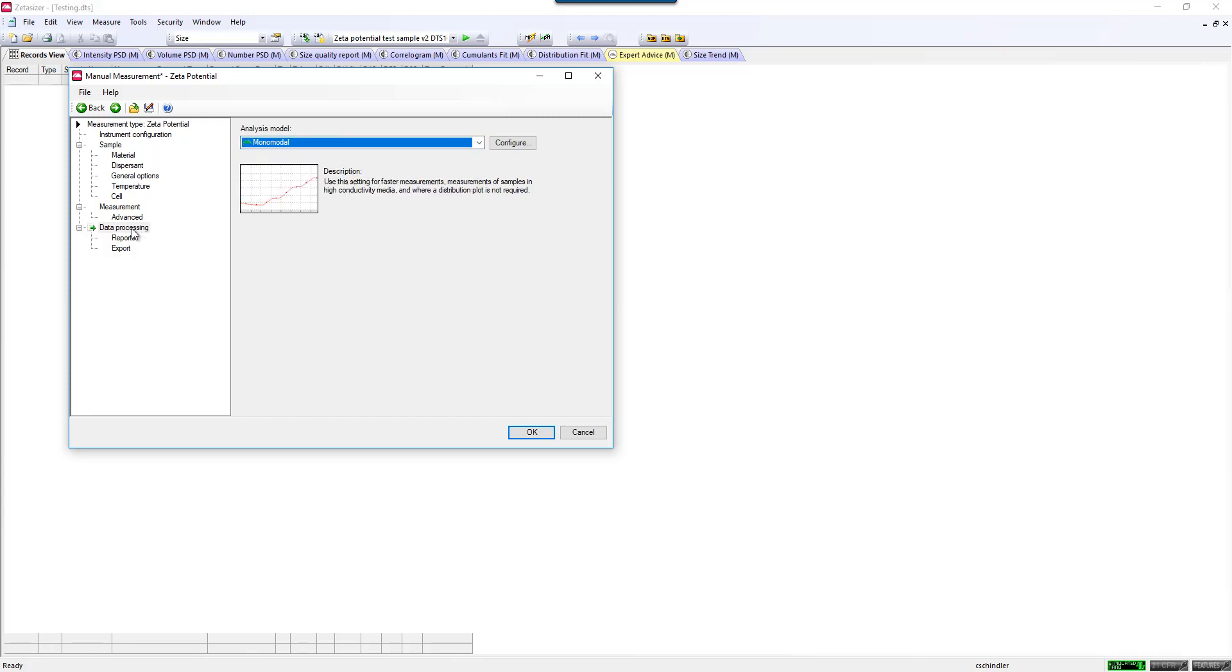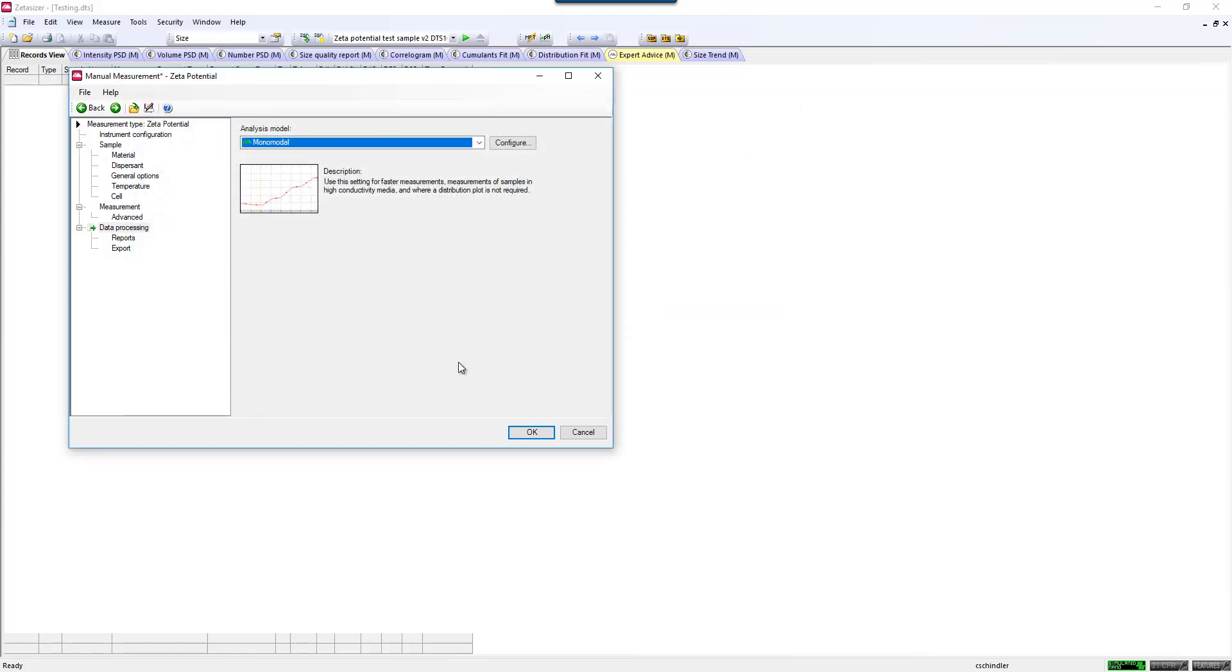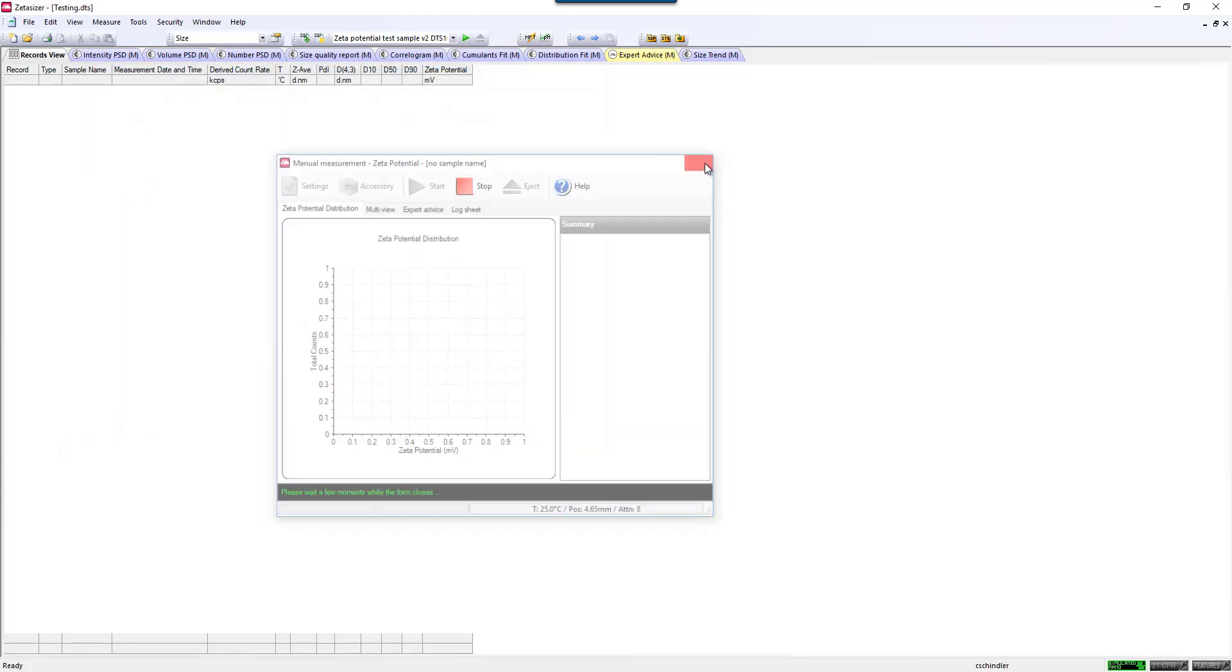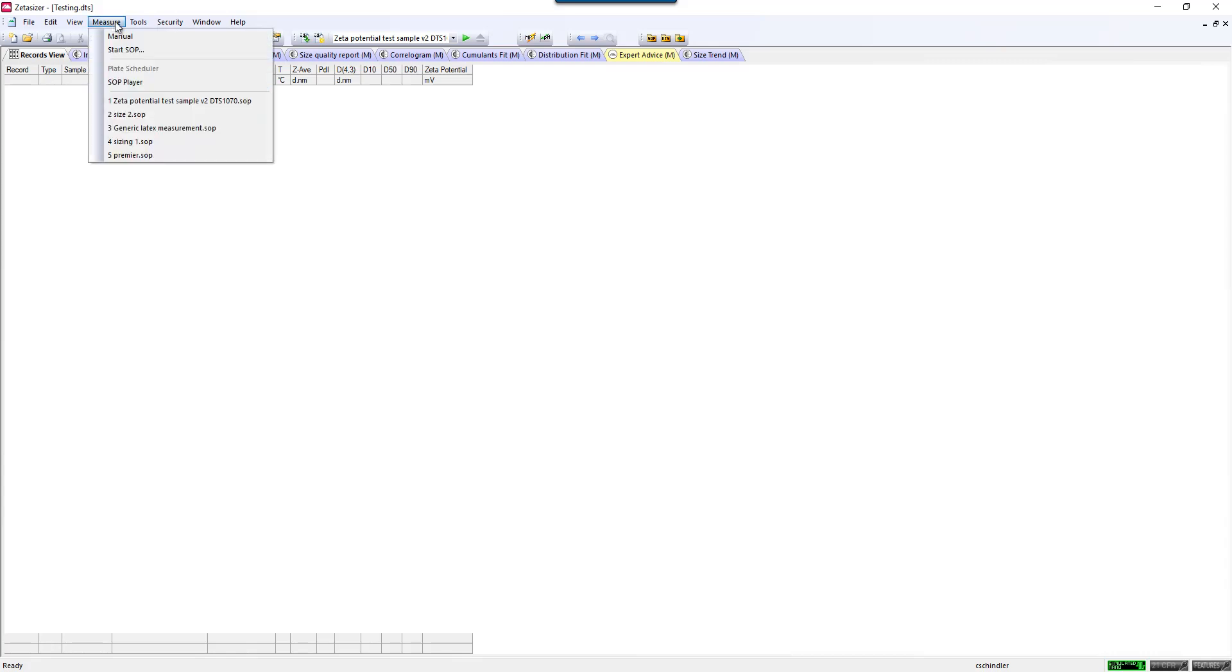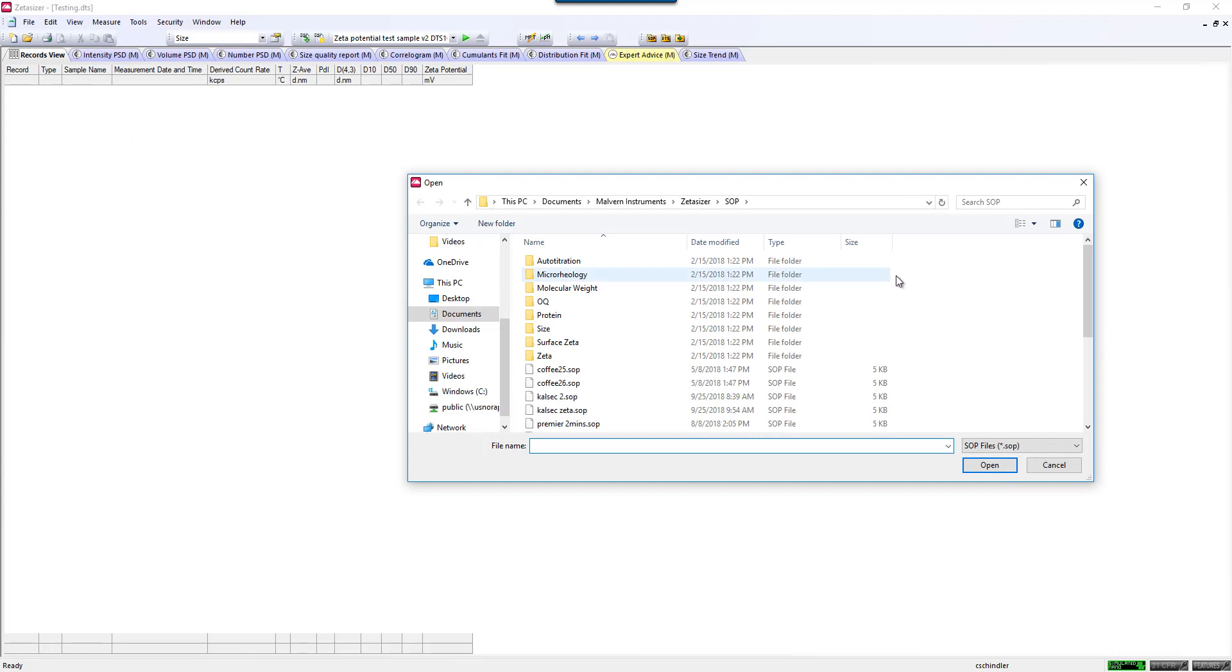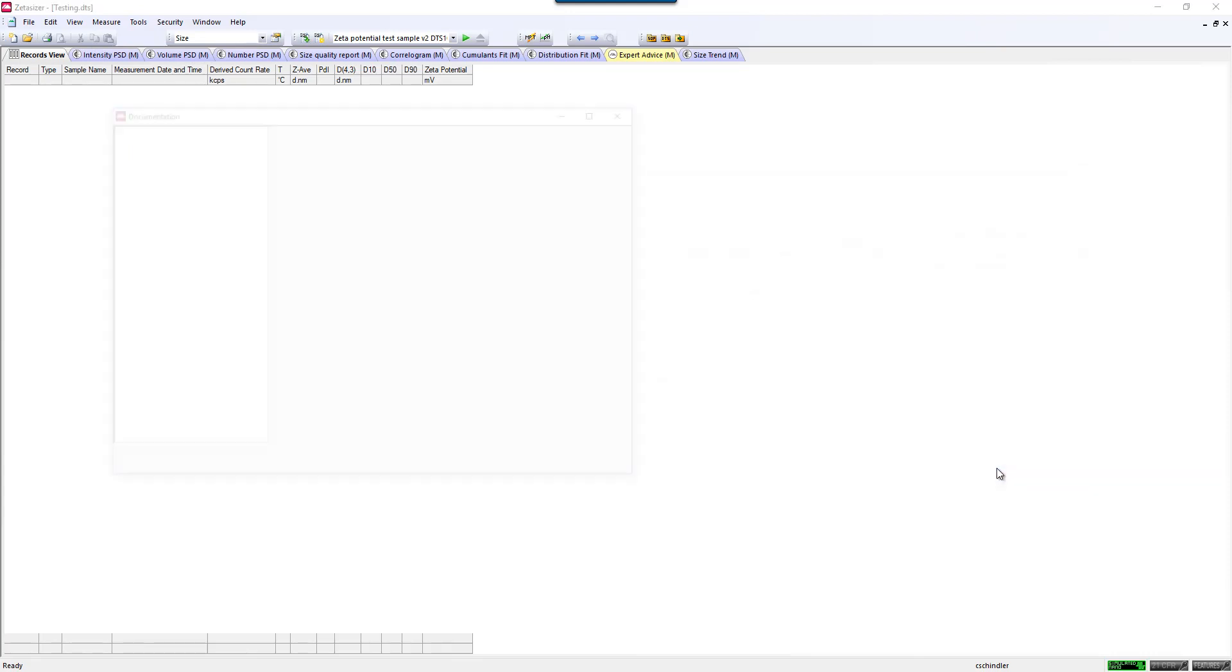If you are happy with your SOP, you can save it with a unique name. And you could immediately run that sample, or if you would like to create more SOPs, you can do that. Once you're ready to make a measurement, go to Measure, Start SOP, and select your unique name that you've saved your SOP as.